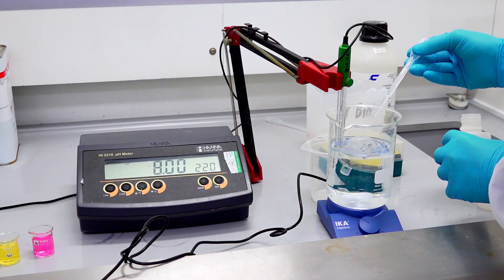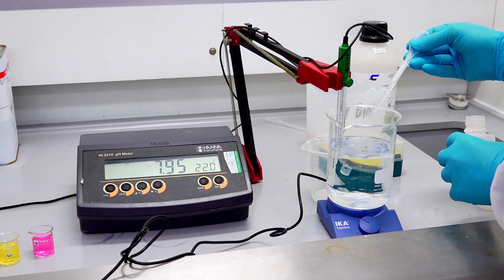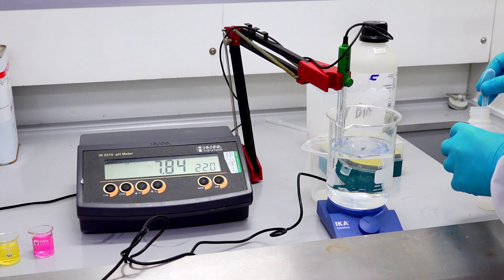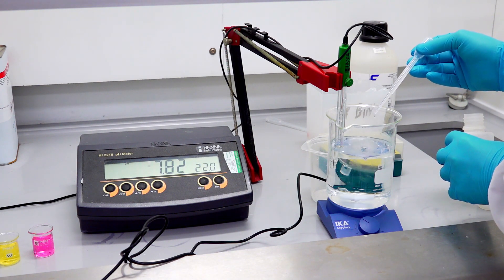Here we're adjusting a molar buffer solution. At the moment we've got the base component of the buffer in solution and we're adjusting it to a set pH — we're aiming for a pH of 6.8 so we can use this buffering in subsequent experiments. What Jack's doing is adding acid into the buffer and monitoring the change in pH until he reaches the target.